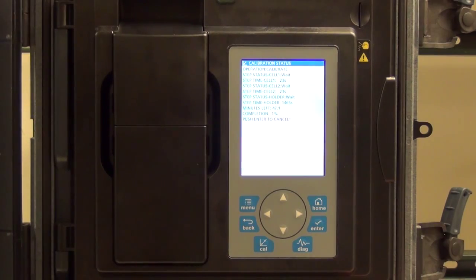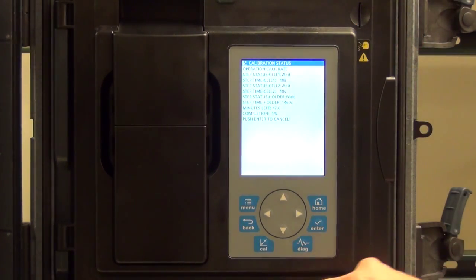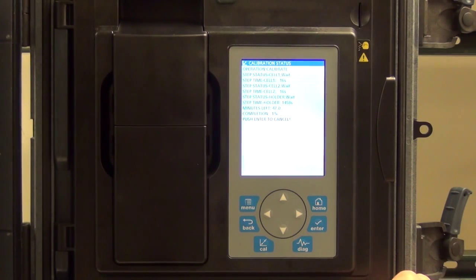Essentially what is going to happen though is the analyzer is going to utilize the onboard standard solutions and analyze them instead of analyzing the normal sample. This is a great way to allow the analyzer to make sure that the results that it gives during the analysis are accurate.